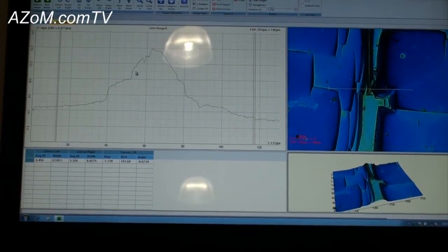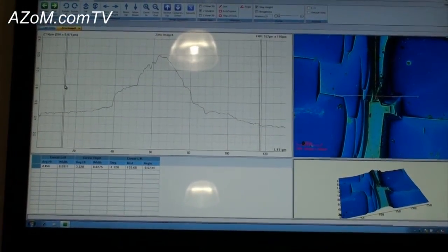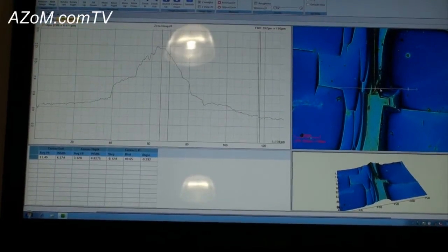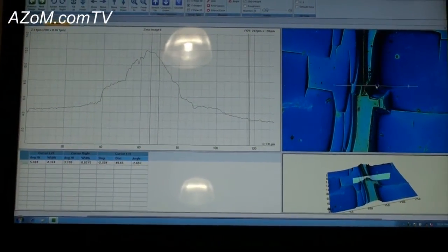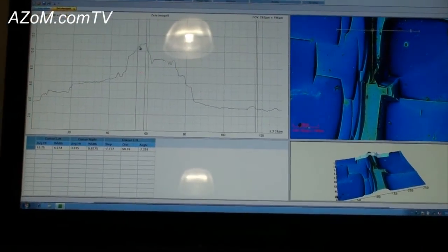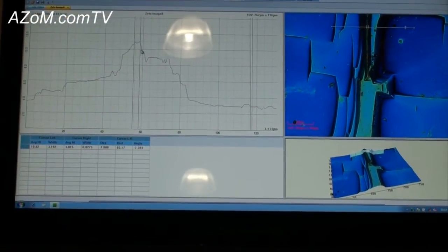Just like that we actually have our image. I can now in the software very easily come over and measure steps. So for example, depending on where I put this particular cursor, I can actually look at step heights by taking averages or use markers and measure individuals.